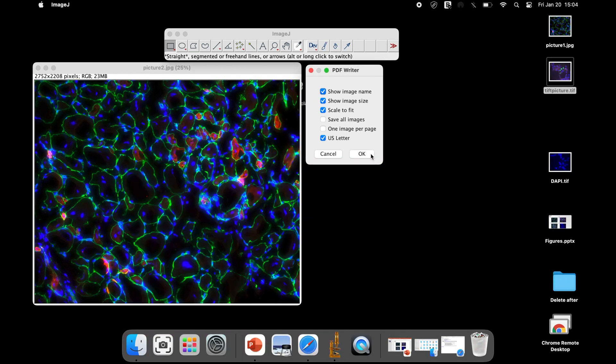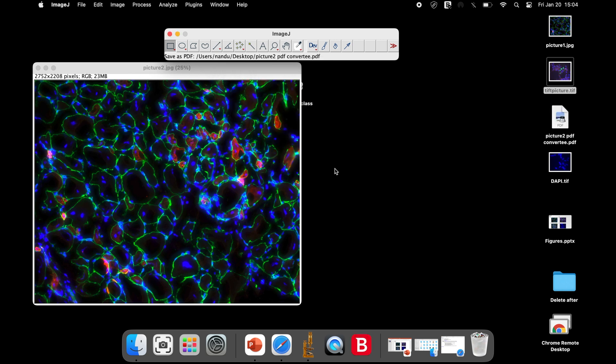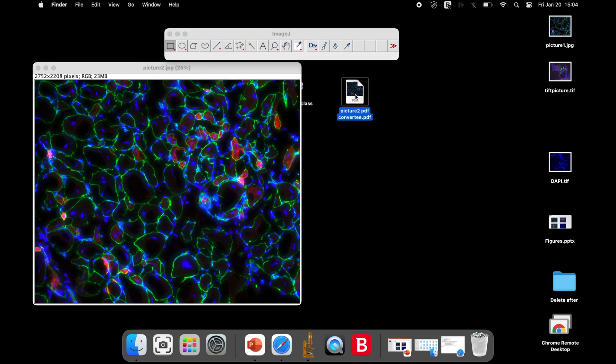Once all the parameters are set in the dialog box, click OK. The next step is to rename the file with a PDF extension and click Save. Now, a new file has been created with the image in a PDF format.